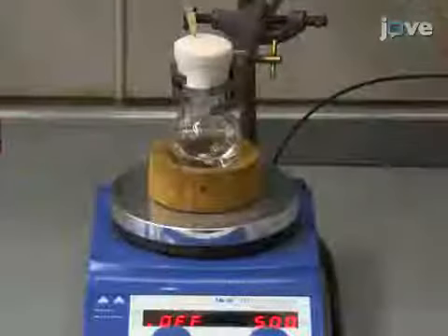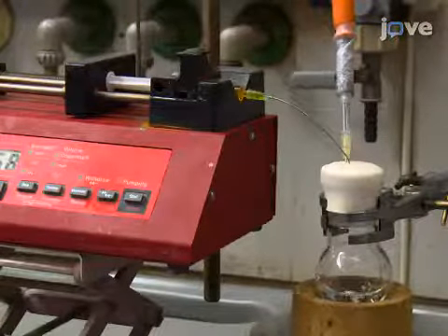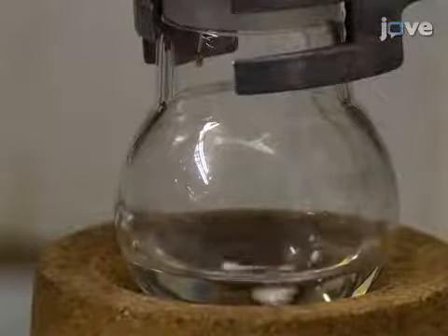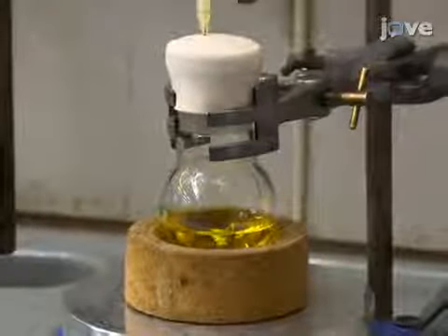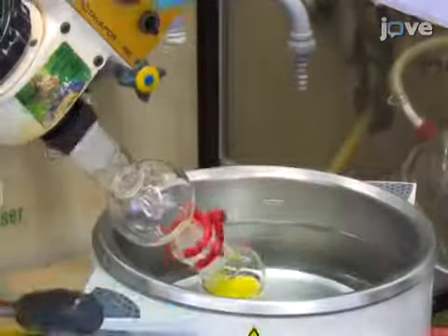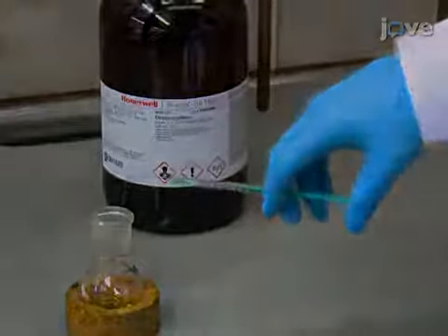Stir the solution at room temperature. Using a syringe, add a prepared solution of diisopropyl azodicarboxylate in THF dropwise over 15 minutes. Then, let the solution stir for 2 hours at room temperature. Using a rotary evaporator, remove the solvent under reduced pressure. After this, dissolve the crude product in 1 ml of DCM.